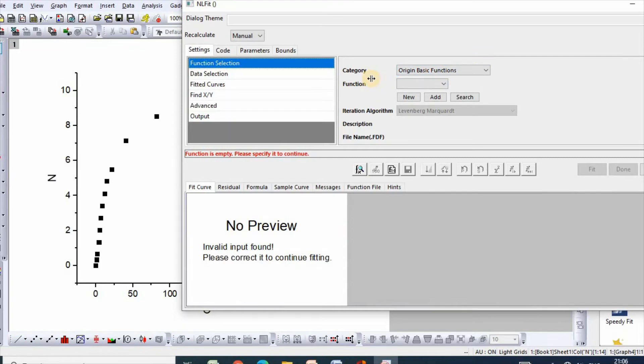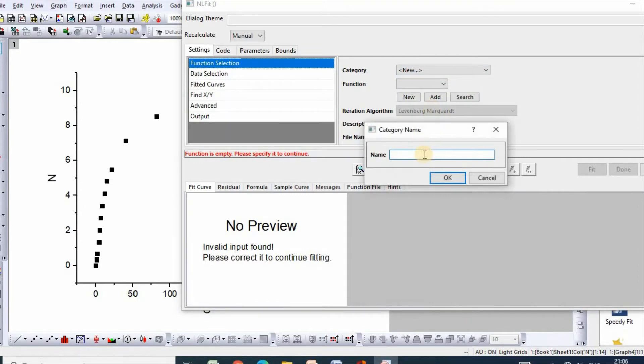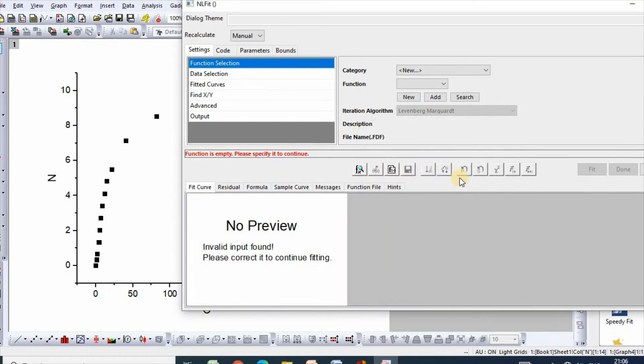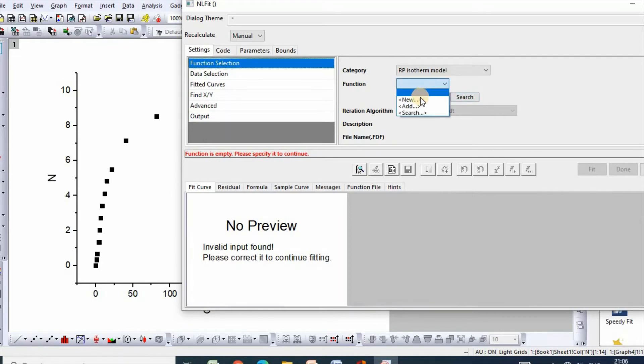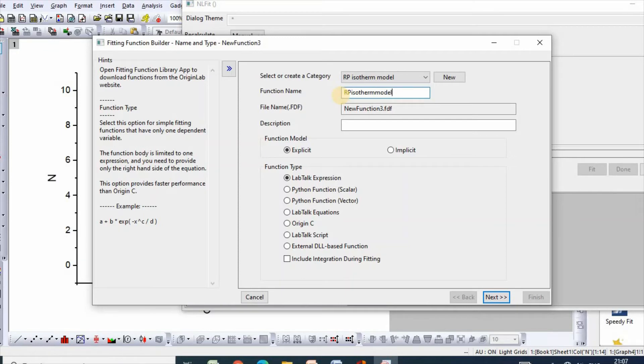You need to select category which is new and you can name it as RP isotherm model. Then for function, you can also rename function as RP isotherm model.